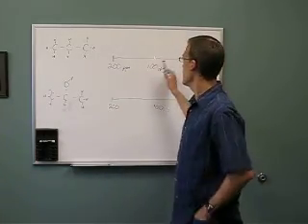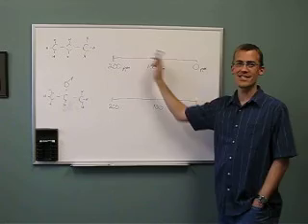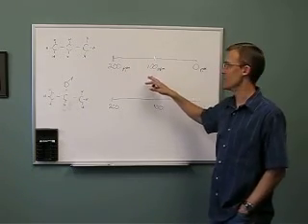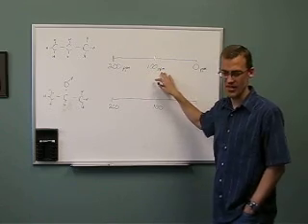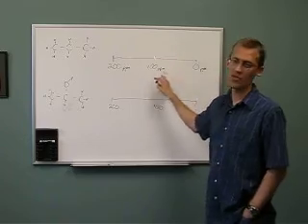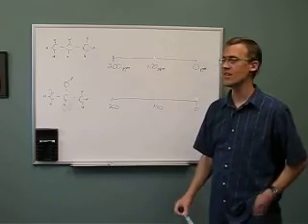Well, on our x-axis, the units are a little bit confusing, and I'll explain those in a second. They're listed as parts per million, which sounds like a concentration unit, which is very odd. Once we go through here, hopefully you'll understand what this means.